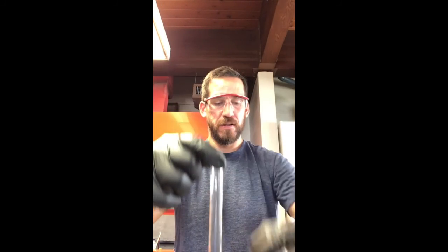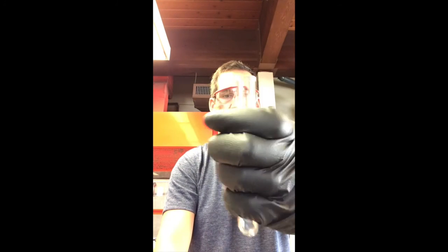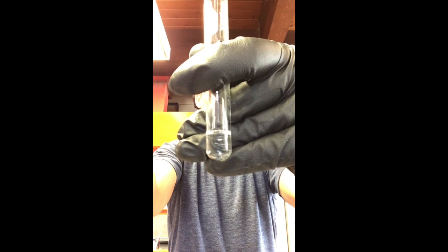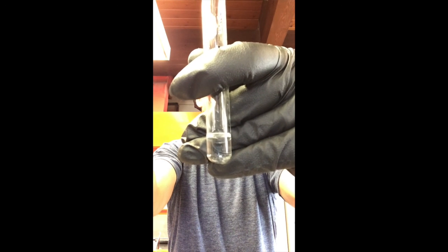We've got our water. Let's do the glove thing. The lighting, man. It's difficult to work with. So lighting, we see a little, we're dropping it in slowly. You might be able to see that layer forming at the top.